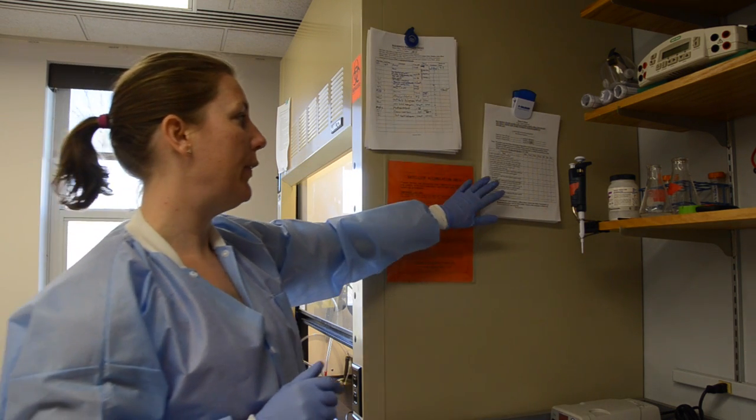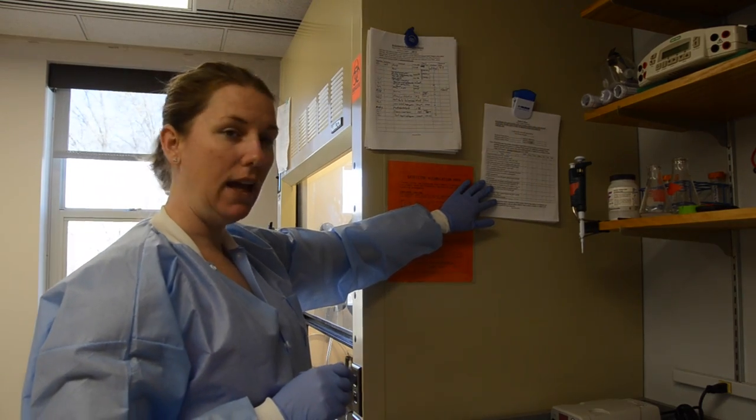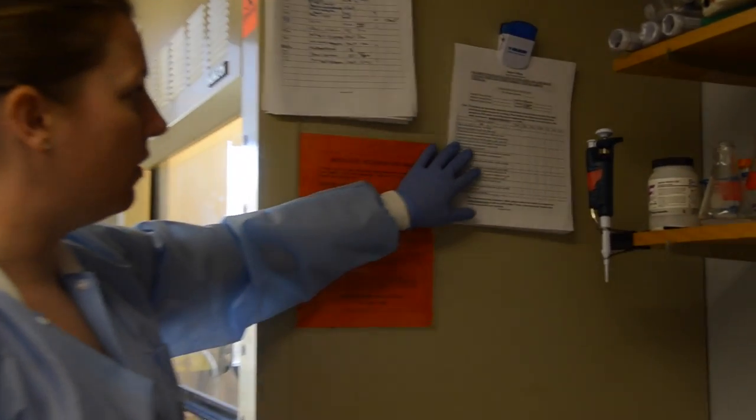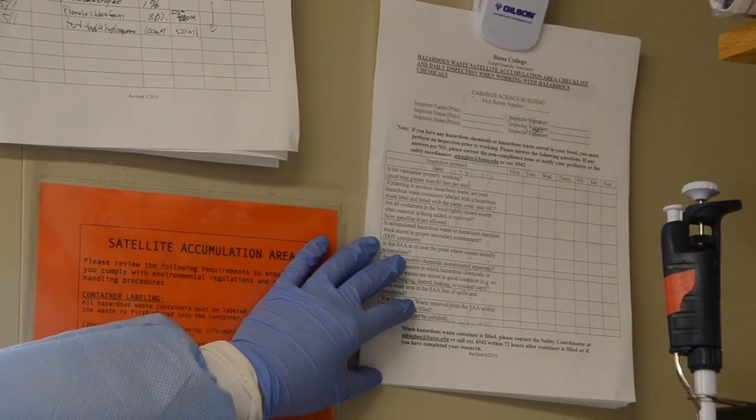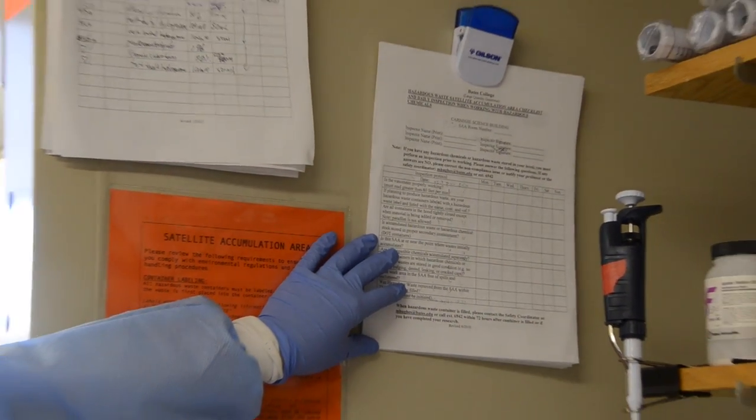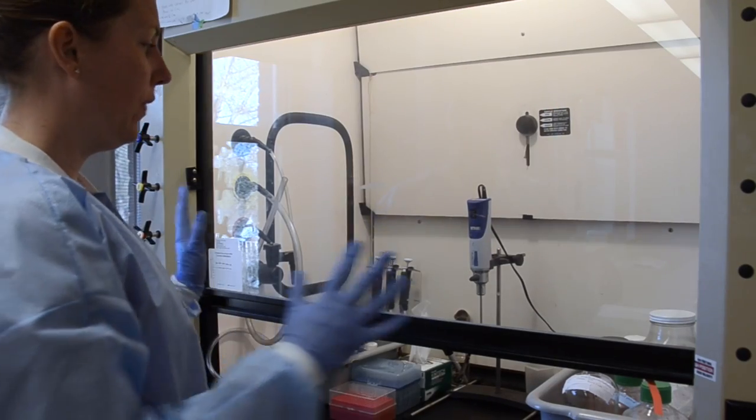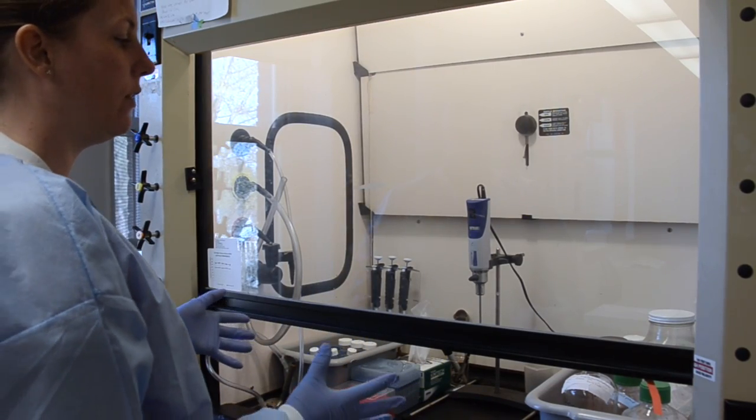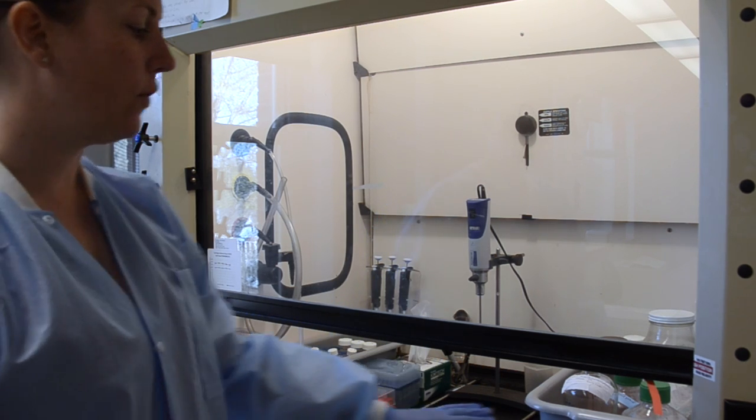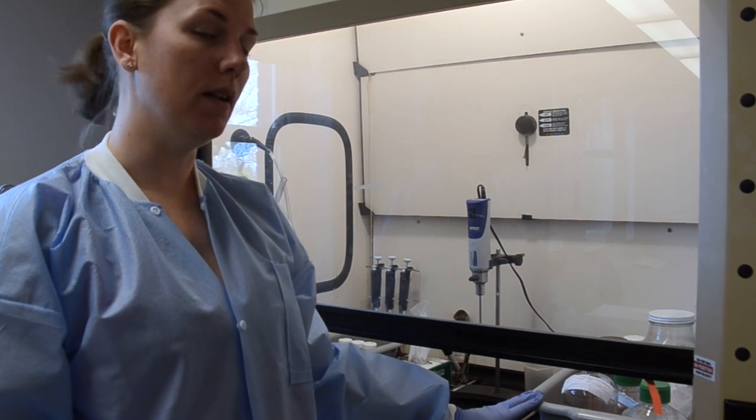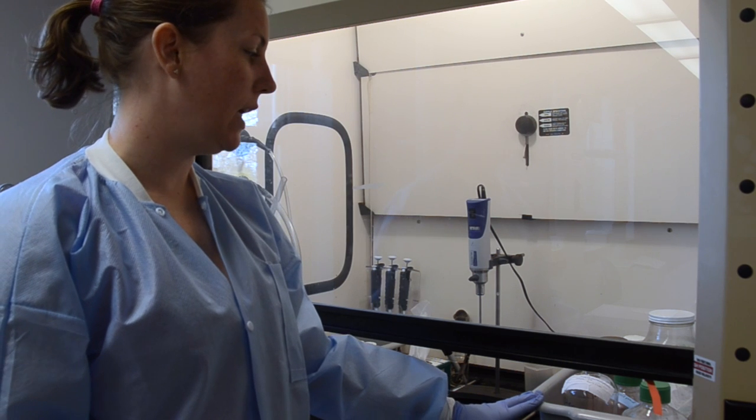If you work in the hood on a particular day, you have to fill out a hazardous waste accumulation area checklist. This is particularly important and required by law. This is our hood. The hood has a wide variety of things in it, the first of which is this gray bin. This gray bin is called a satellite accumulation area. This is where we keep hazardous chemicals.